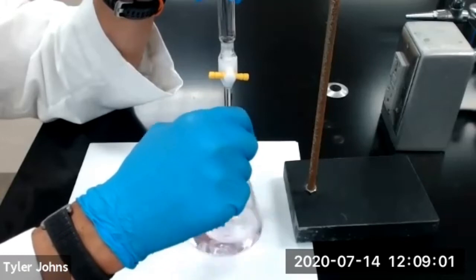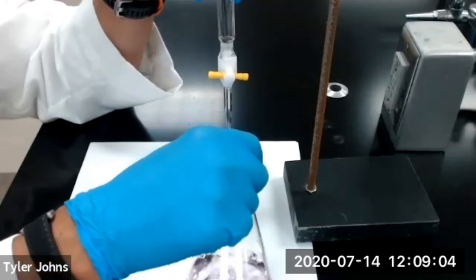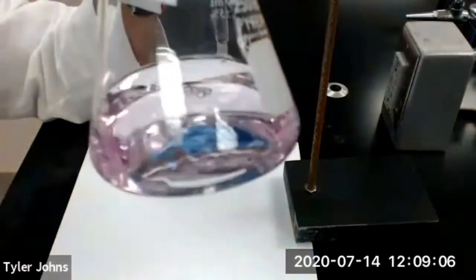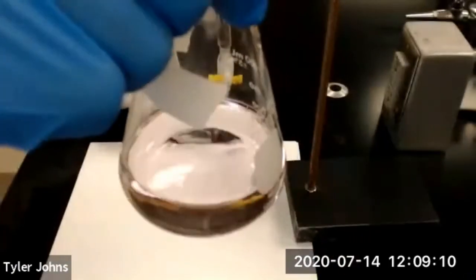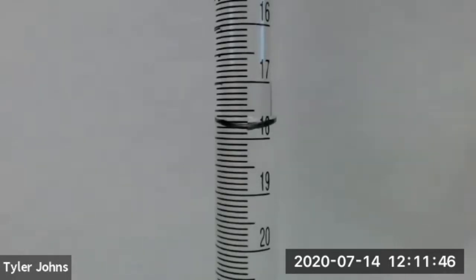We now have a persistent very faint pink color, so we have reached the endpoint for titration number three. This is our final burette reading for titration number three.